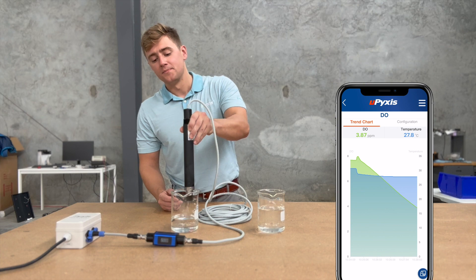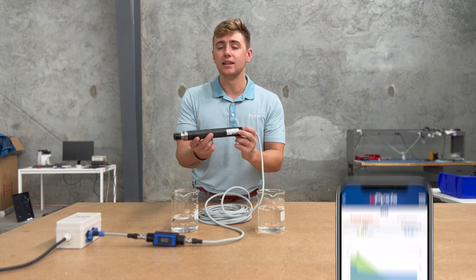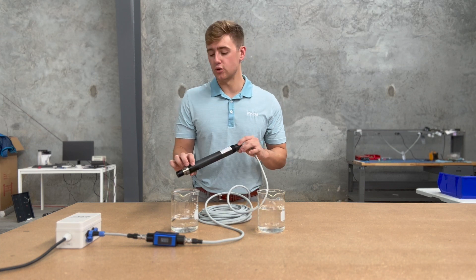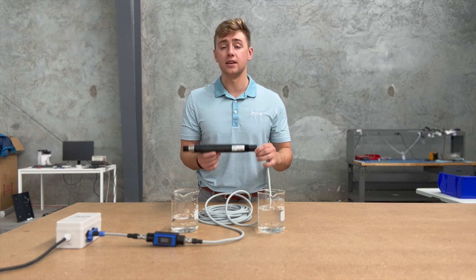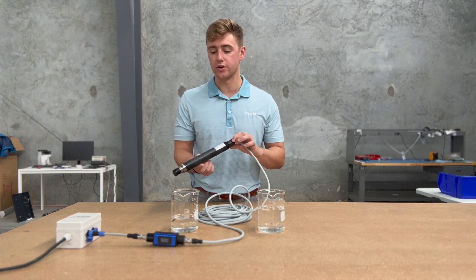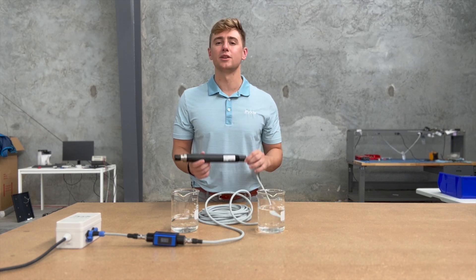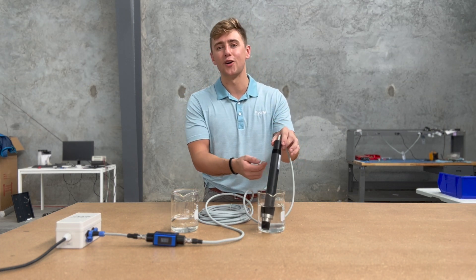The sensor itself is really simple and really lightweight — even the stainless steel models are pretty lightweight. It's submersible, so you would install it by submerging the sensor, or you would install in a T for the T versions. The ST773 is also submersible and inline T compatible. That's the sensor — just wanted to break down the ST772 series for you. Hope you all have a great week, see ya!